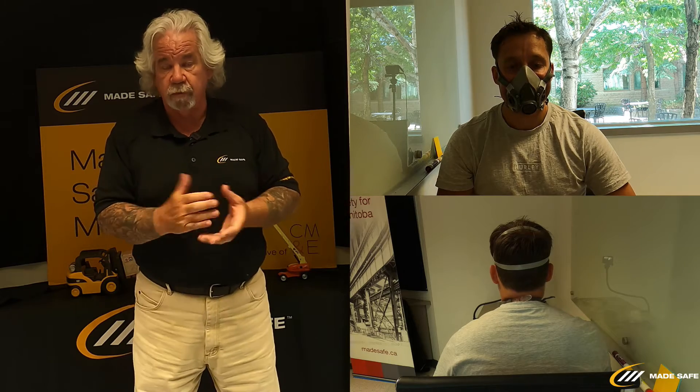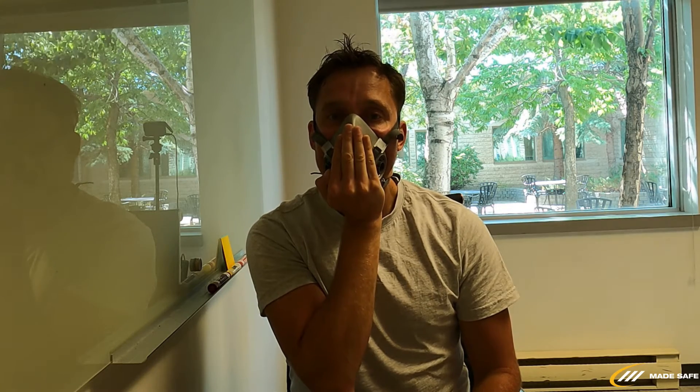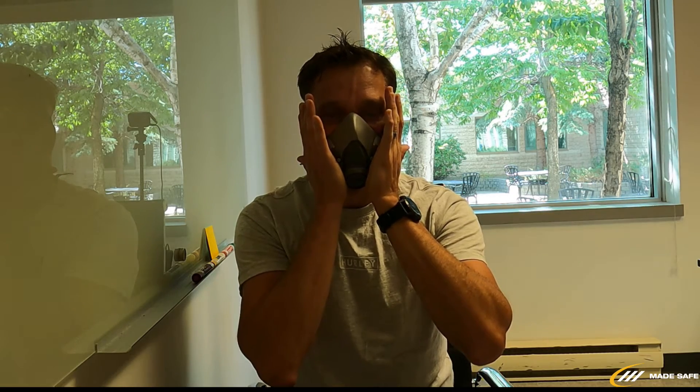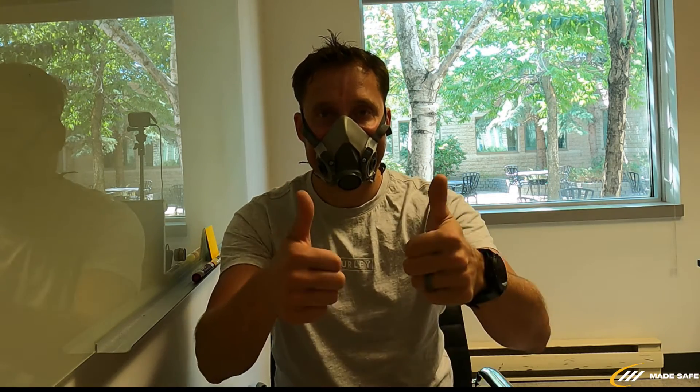Now we'll do our negative and positive checks for the half mask. For the positive check, I'll ask Reg to cover the exhalation valve on the front and breathe into the mask normally. We're looking for the seal — the mask should expand a little bit and we're looking for no air escaping around the seal. If any air is escaping, Reg would readjust his mask and re-perform the positive check.